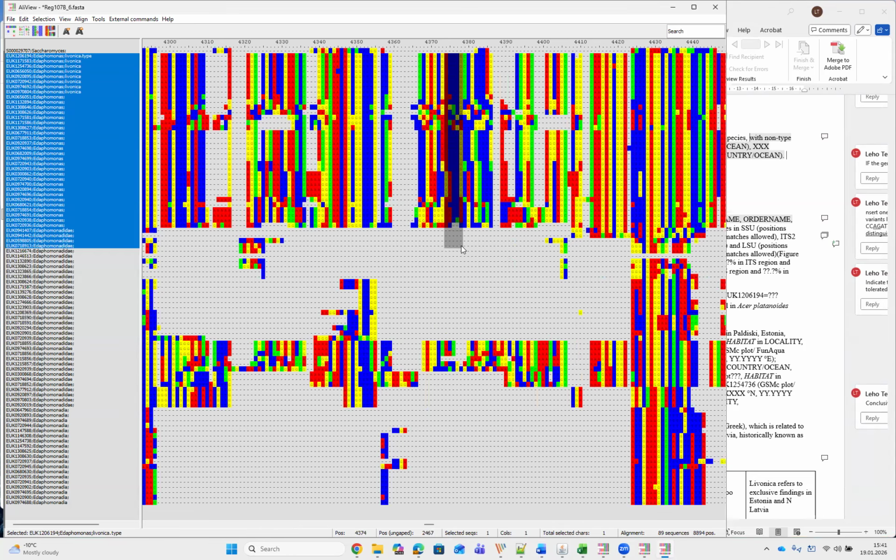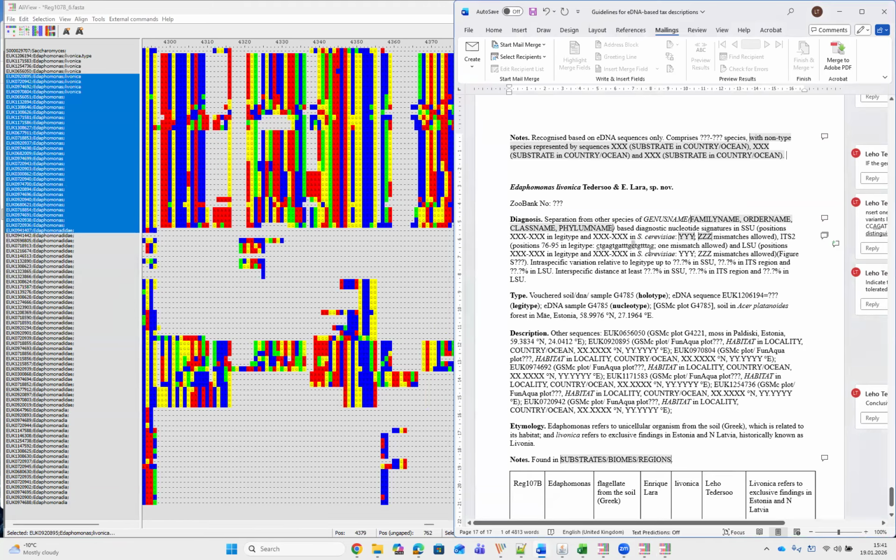T's are not unique. Then again this C. And the terminal A and G are unique. So C, A, and G. So roughly 6 well distinguishing nucleotides compared to other taxa in this group, this genus. Of course, they are not all exclusive differences at all.